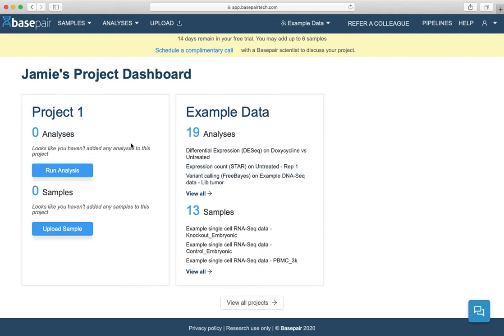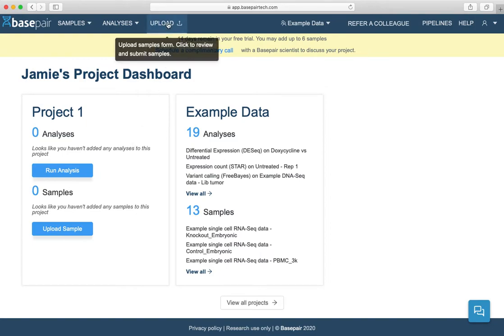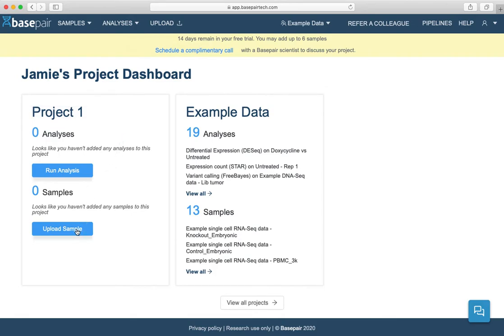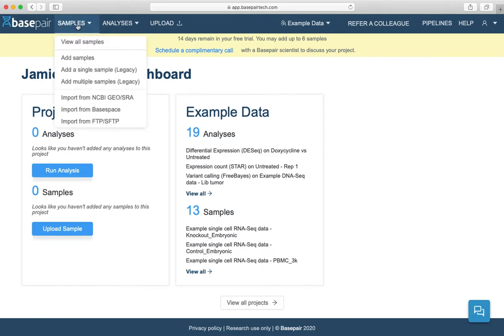There are a couple ways to upload a sample from your computer. You can click the upload tab at the top, or you can click the upload sample button directly. Also, if you have an Illumina BaseSpace account or your data is stored on an FTP drive, there are two much faster ways to upload your samples to BasePair. Hover over samples, then select import from BaseSpace or import from FTP. You can also upload samples directly from NCBI's Geo and SRA databases.